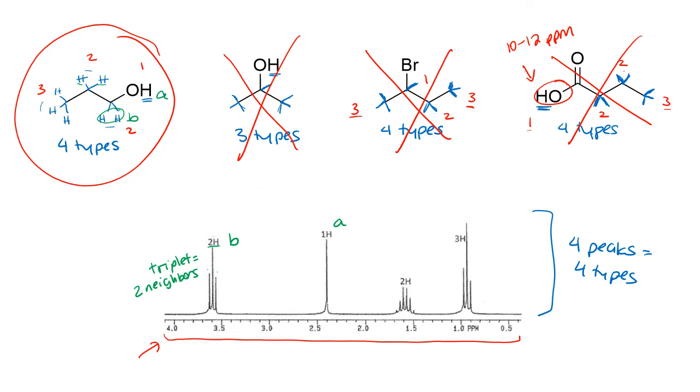Next, we have another group of two hydrogens. So I'll go ahead and call these group C. Now we have one more peak that is associated with two hydrogens. And again, let's go ahead and verify the neighbors or the splitting. So we can see that this peak is split into quite a bit. We have 1, 2, 3, 4, 5, 6 splits that we can possibly see.